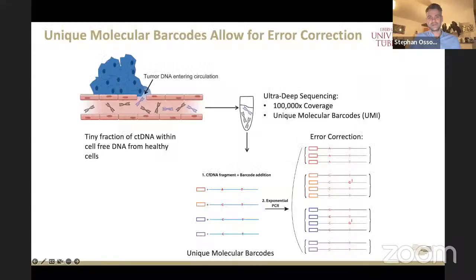One original copy. And the good thing is you can then easily spot sequencing errors. If the copies don't agree, that must be a sequencing error. But if there's a real change from A to C, and you see that in all the copies, you can be relatively sure that it's a true change.